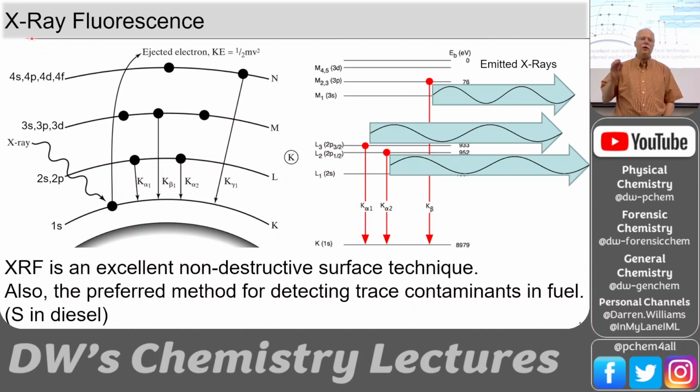So here's what's going on with X-ray fluorescence. We like to pound it with a high energy X-ray, so we're knocking out core electrons. For certain materials, typically we ignore rows 1 and 2. Beginning with row 3 of the periodic table, that's the information we're going to get. Now that's disappointing if you want to get something about carbon, nitrogen, oxygen, and fluorine.